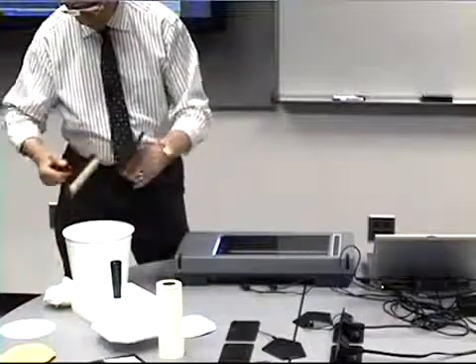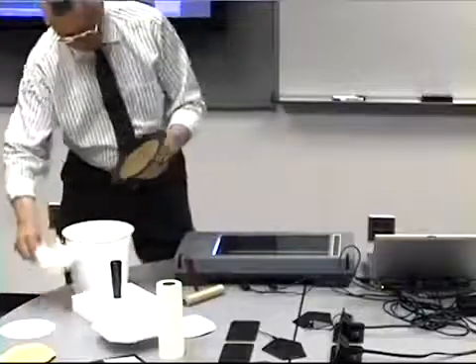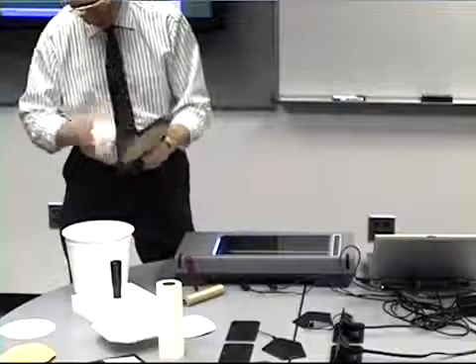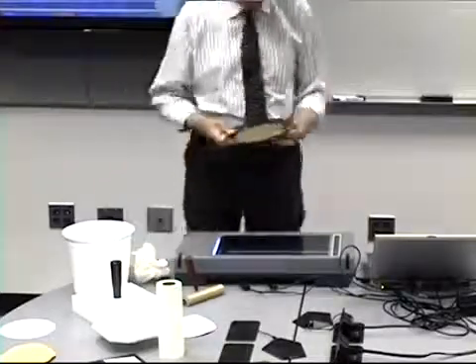Is there a reason? Yes, this is a black back plate, because in fact our stickies, the hand sheet, now I don't know whether you can see that there. We'll put it on the stage again.